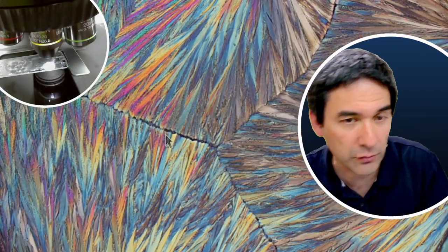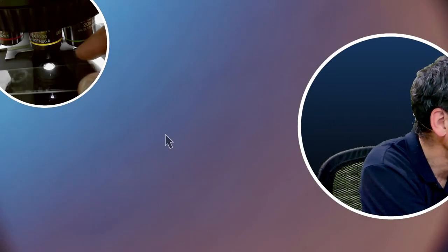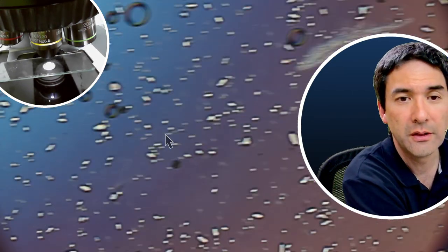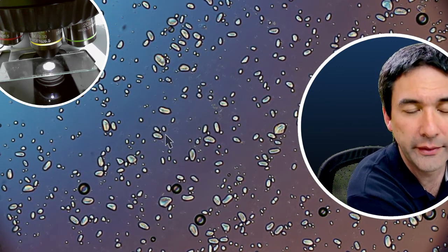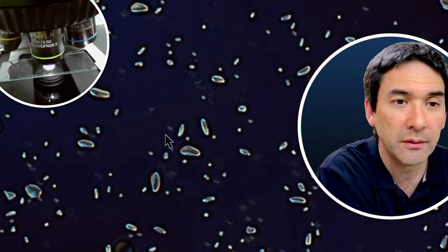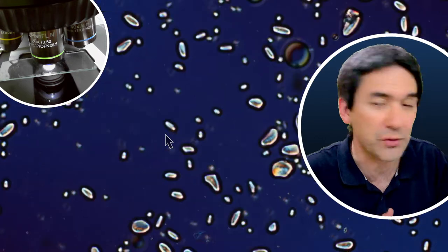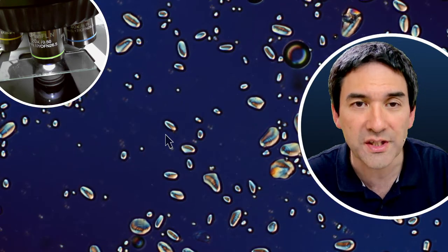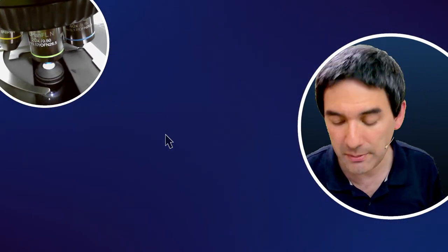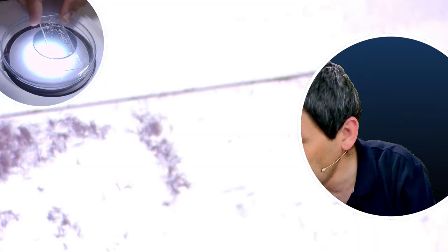Let's try the regular microscope view first, so that we see what we have to expect. Yeah, and where are they? Here they are. These are my starch grains as we know and love them. Okay, here they are. So now let's try those with a stereo microscope, and that is going to be interesting because you actually need a higher magnification for those, but maybe it will work out, and that's why I would like to figure this out, if this is actually possible.